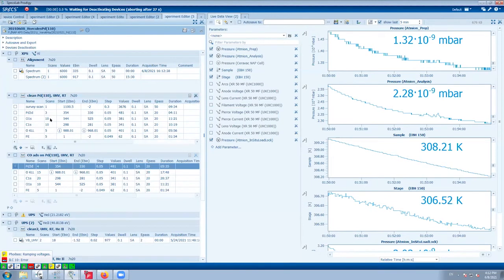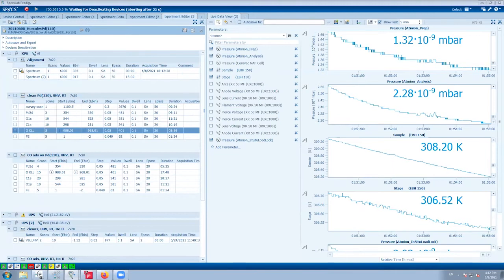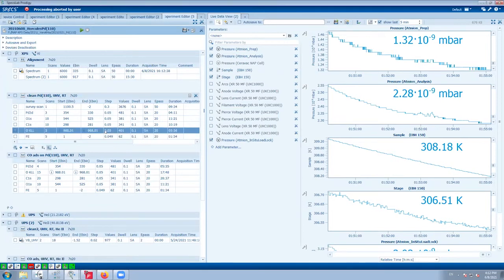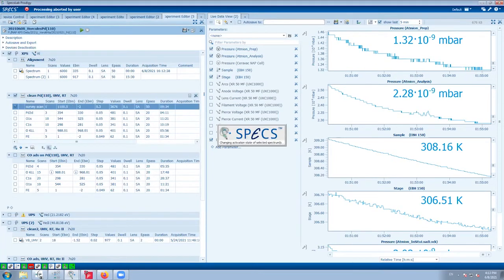The anode is actually made of silver, and there is a 100 micrometer thick aluminum layer. You irradiate this aluminum layer with high-energy electrons and get characteristic X-rays. They said you simply evaporate this layer.